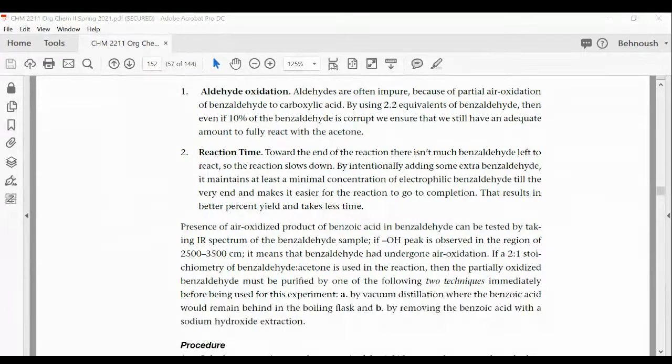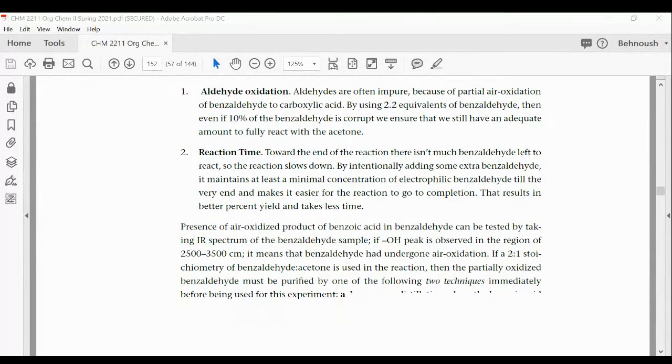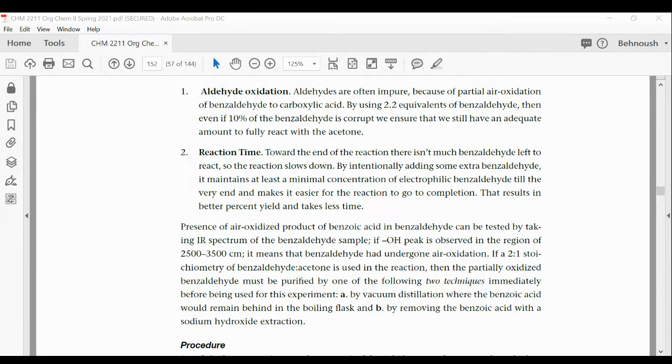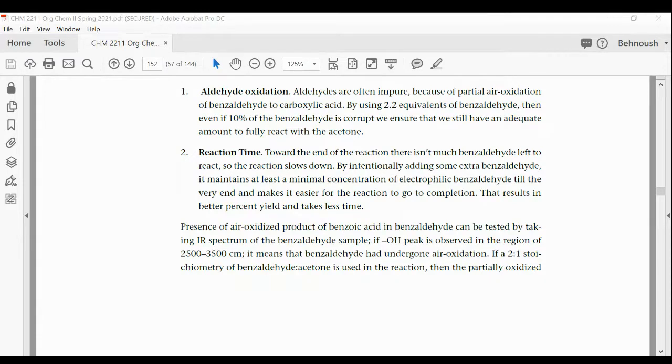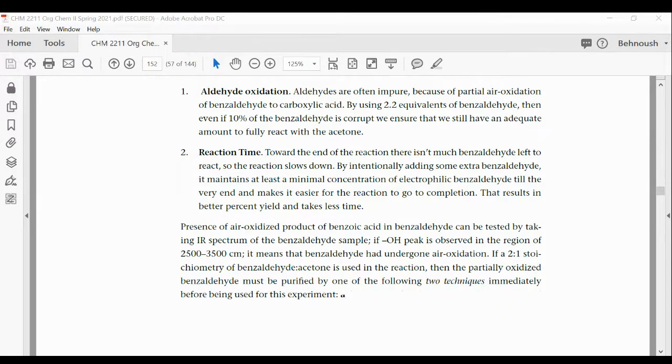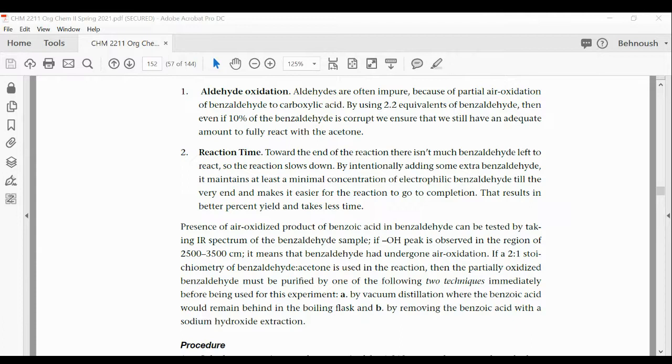Doctor, I have a question about what you just said. So basically, the discussion area must include a section where you talk about how conjugation affects what we see in the IR, and yes, the location of the peak from the IR spectrum for the C=O double bond. So that should be mentioned, how that helps us identify the final product as the correct or desired final product. Exactly. Very good.